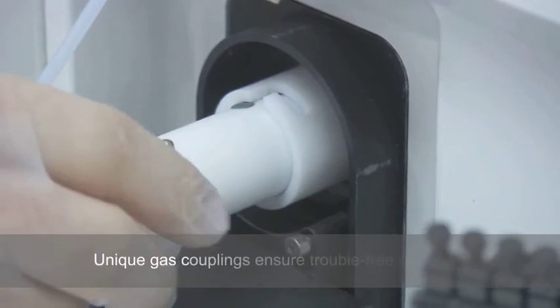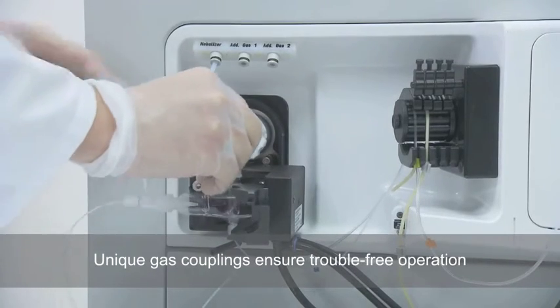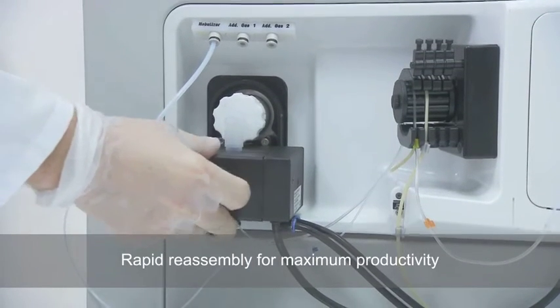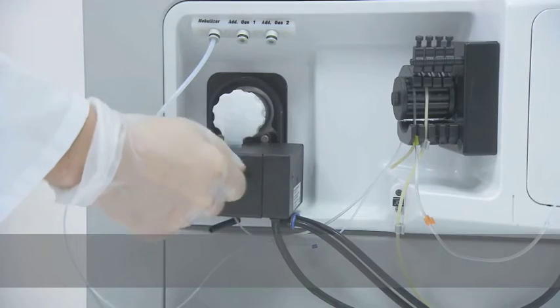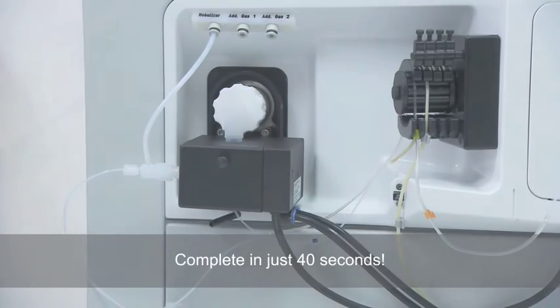Unique gas couplings integrated within the body of the torch holder ensure trouble-free operation. Rapid reassembly of the sample introduction system ensures maximum productivity — complete and ready for analysis in just 40 seconds.